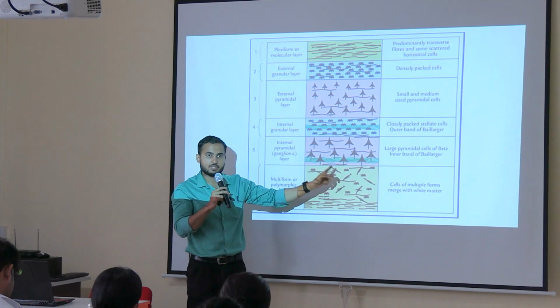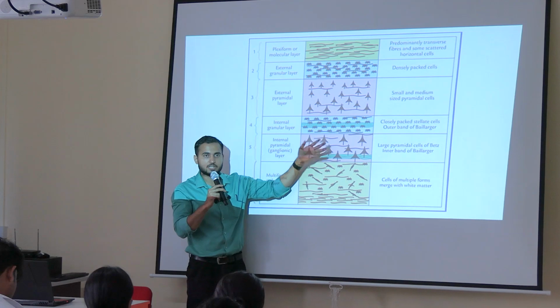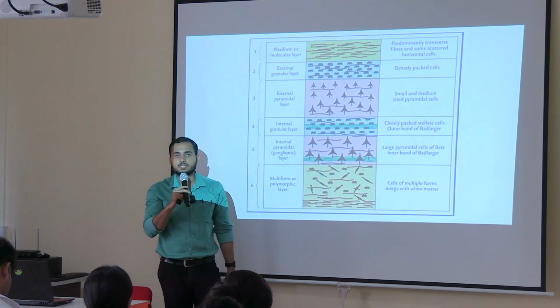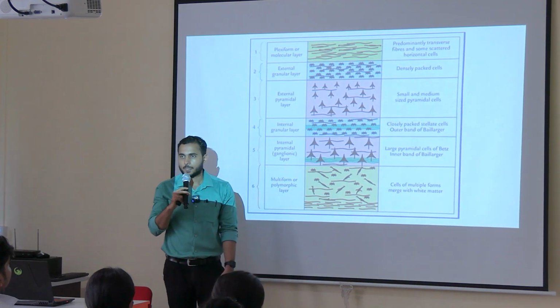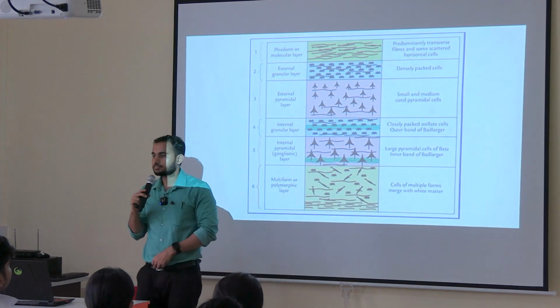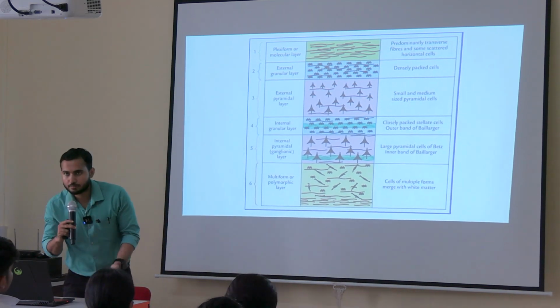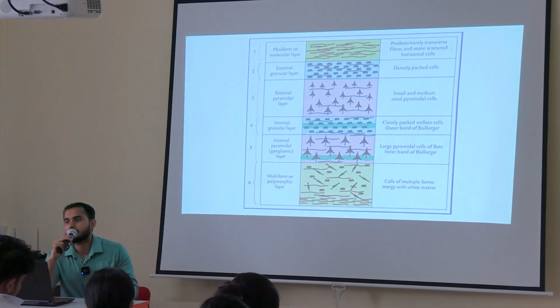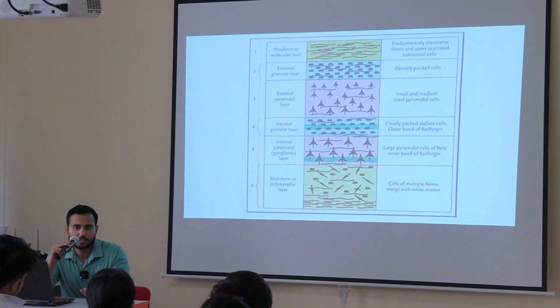But the same thing, when you see under the microscope, ये lines दिखाई नहीं देगा. At that time how will you understand कि ये कौन सा layer है, ये कौन सा layer है? How will you understand? Yeah, based on the staining properties. Simple. At that time, based on the staining properties, you have to understand which layer is which. So you have to know the staining property.